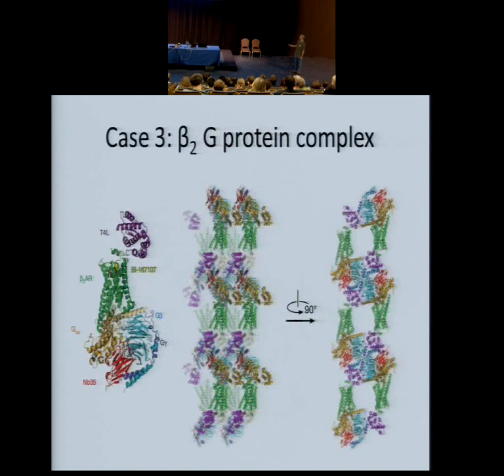And this is just showing the unit cell, which I think is kind of interesting. The receptors are actually fairly well separated from one another in the crystal lattice. They're separated by a large gap, which is presumably filled with lipid. And then the aqueous layers are much more densely packed, and those contain all of these other subunits. For instance, the T4 lysozyme molecule, the heterotrimeric G protein, and the nanobody.